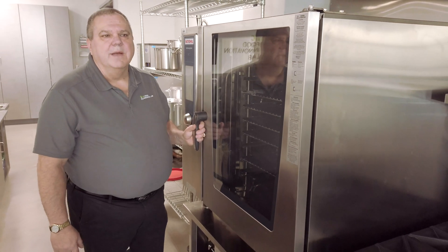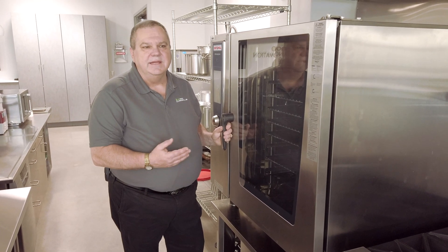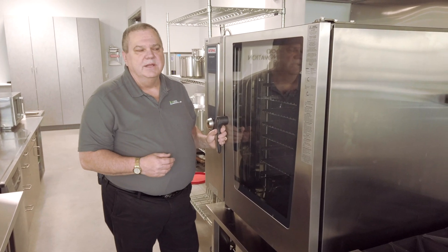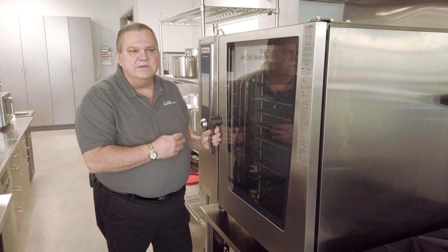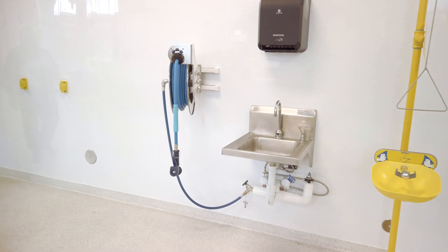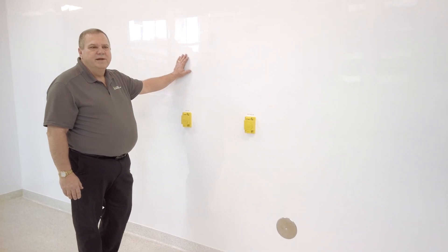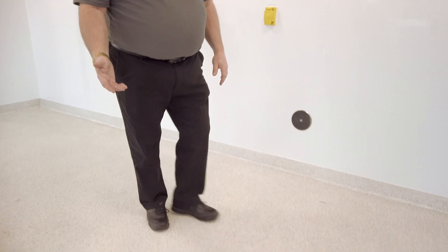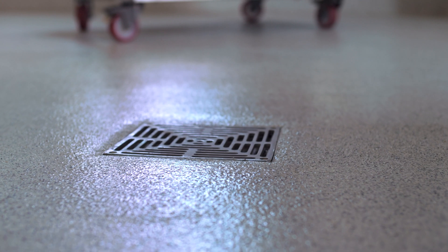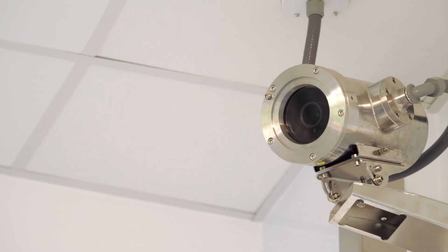We have in our facility a Rational combi oven. Combi ovens today are being utilized by more restaurants and hotels because they're a rapid method of cooking — they cook utilizing humidity and heat and can hold temperature for an extended period of time. This particular oven can also give us unique roasted colors and roasted flavors not possible with a normal oven. A few construction features of our facility include walls covered by Creedite, a polymer approved by the FDA for use in food plants — it's very easy to clean, very durable, and non-penetrable. The floors have been covered with an epoxy concrete nine layers thick, rising from drains with baskets up to the walls three and a half inches, so water drains easily. Ceilings are all wash-down, and we have security cameras throughout the facility.